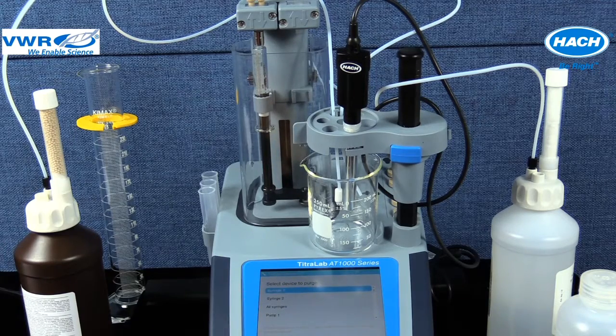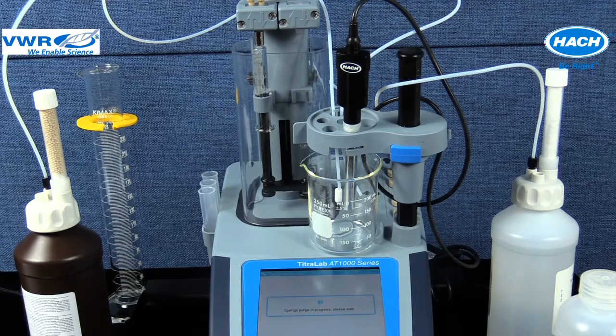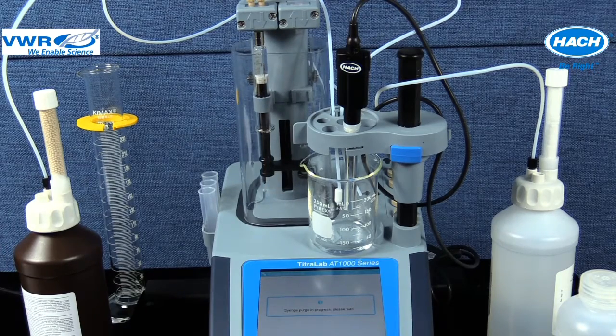Place a waste container under the sensor holder and select the correct position for syringes and pumps to purge, then push start. In this example, syringe 1 will be purged to correspond to the syringe connected and application loaded. When the syringe purge is selected, the titrator pulls titrant from the titrant bottles and fills the syringe several times. Any air bubbles in the syringe should be evacuated during the filling and dispensing action. Fresh titrant is seen leaving the diffusion tip.